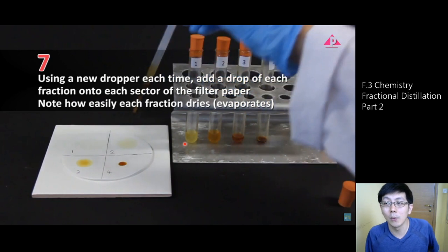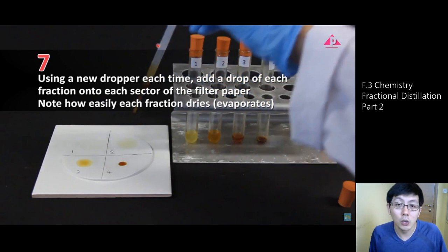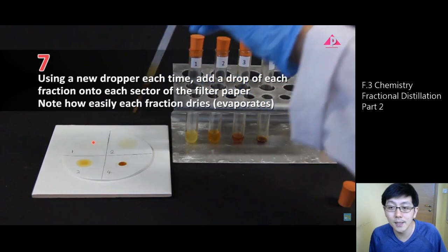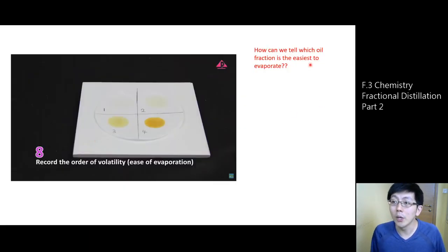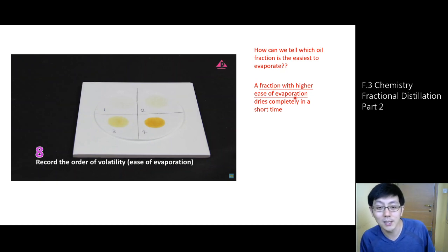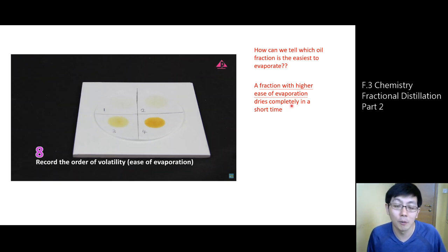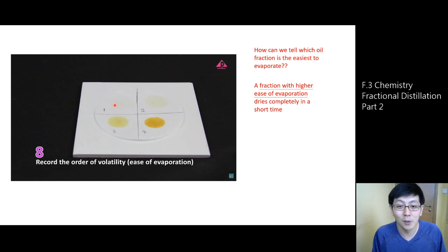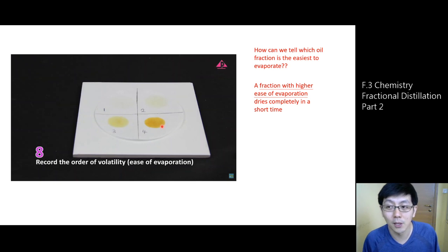Back to our experiment: how can we compare the ease of evaporation? We use a dropper to place these four oil fractions on a filter paper and observe the marks they leave. If a fraction has high ease of evaporation, it dries completely in a shorter period of time. You can see fraction 1 has nearly disappeared after the same period. Fraction 2 shows some yellow marks. Fractions 3 and 4 leave traces that last for a long period of time.